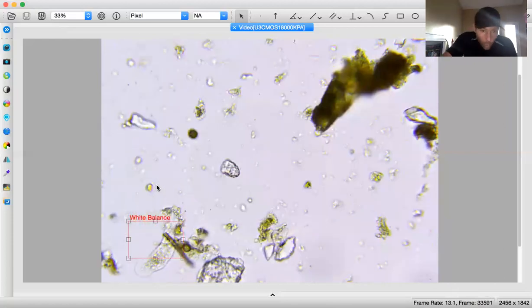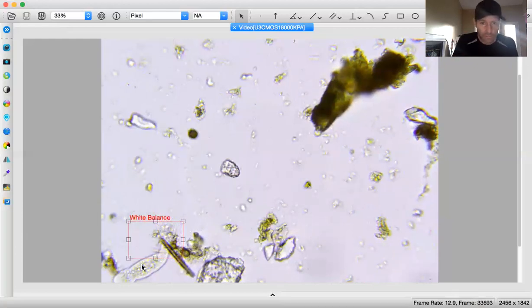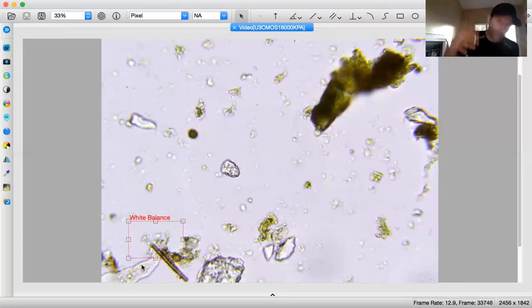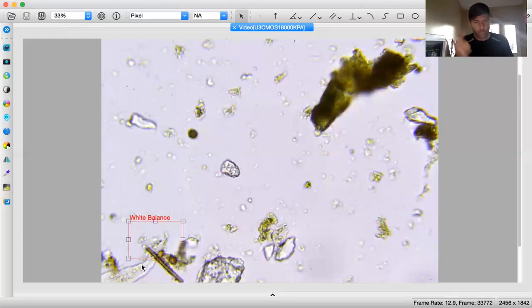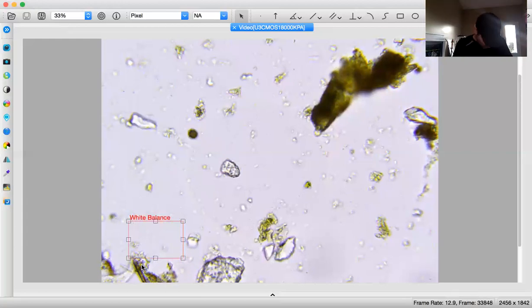Ooh, look! Naked amoeba! Naked amoeba! That's so cool! This is the first assessment attempt I've done with a naked amoeba. That is awesome. I wish we could do more than just record it because it's so cool. But all I can do is put a 1 down. That is on number 4. Amoeba is 1.